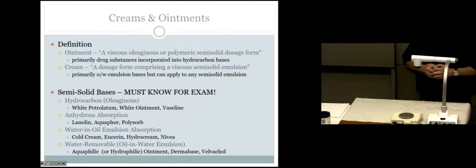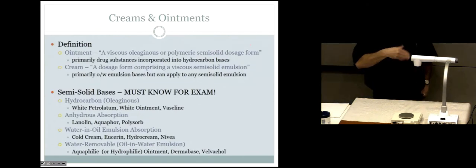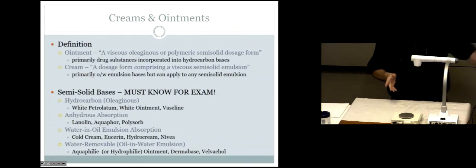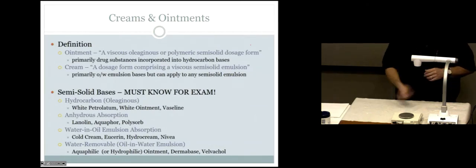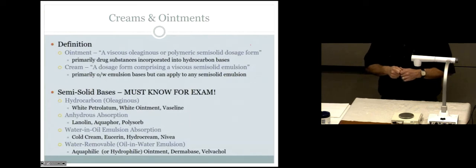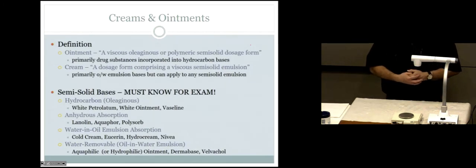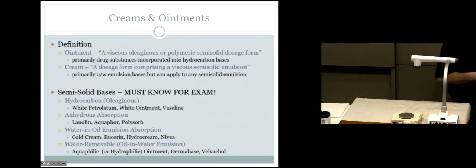I will never forget, at the med center, I had a prescription for 5% LCD, which is this liquid goo stuff that you're going to see here in the dry lab in a little bit. It's a liquid, and 5% of that needed to be incorporated into Vaseline. The prescription was for Vaseline, right? I didn't know all of this as well back then, so I just took my Vaseline, made a little divot, added my stuff, and squish, squish, squish, and then looked at it, and squish, squish, squish again, and I stopped, and it just puddled on top of the Vaseline. That liquid would never go inside there. It was a huge failure. So we had to call the doctor. It was like, doctor, this is not working. What else can we do? And we thought about it, and we came up with the second category.